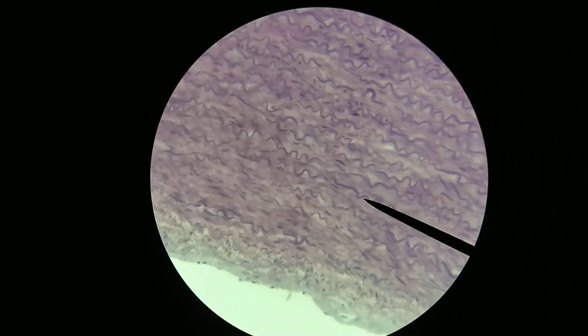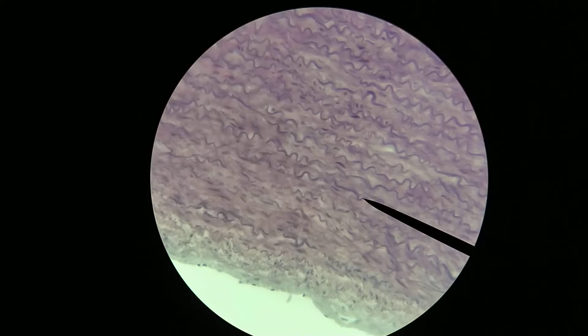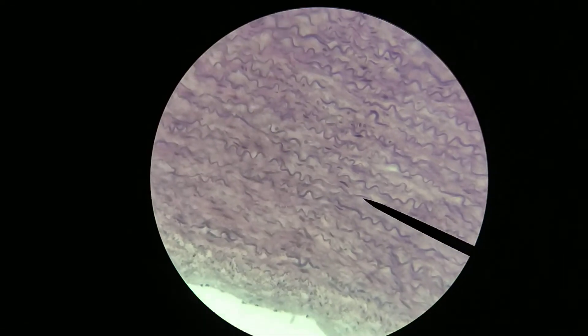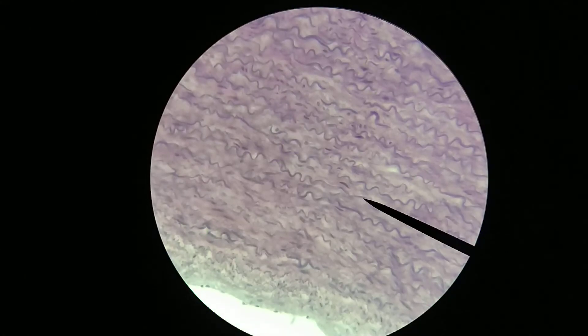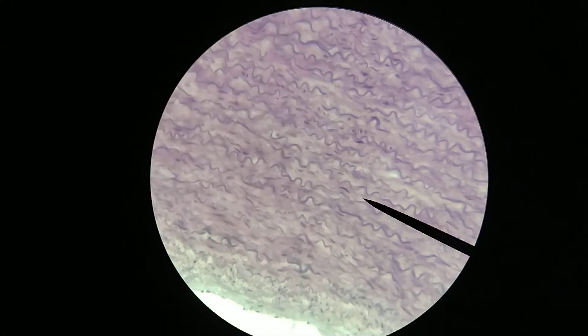We have internal elastic, sorry, not internal elastic membrane, but a thick band of elastic fibers, kind of a sheet of elastic fibers, and then a layer of smooth muscle, and then another layer of elastic fibers, then another layer of smooth muscle.